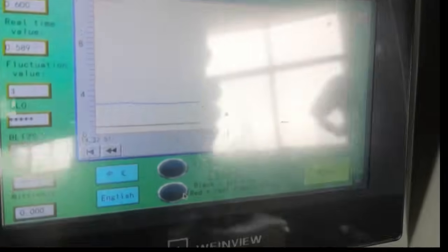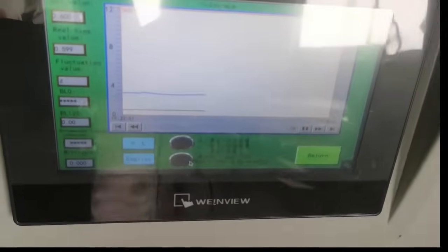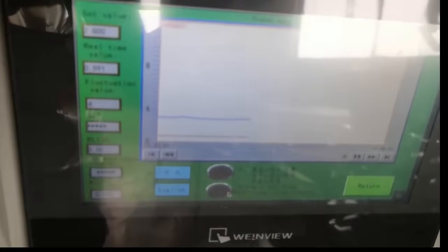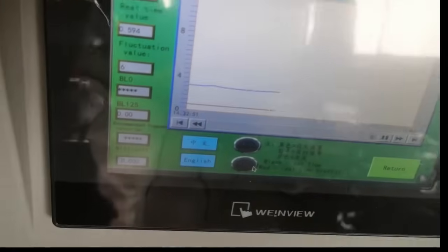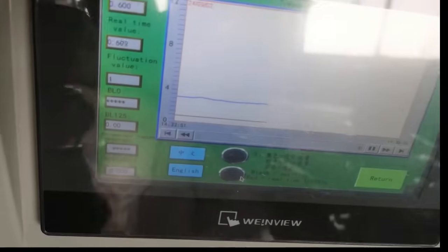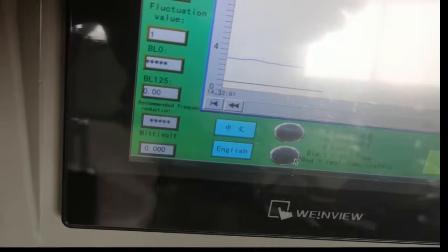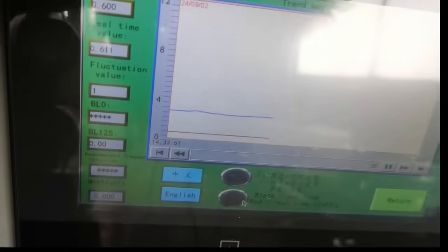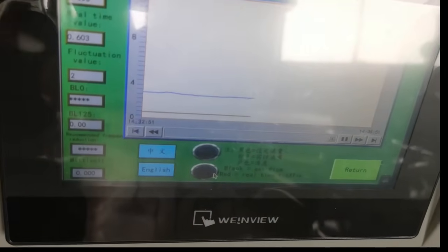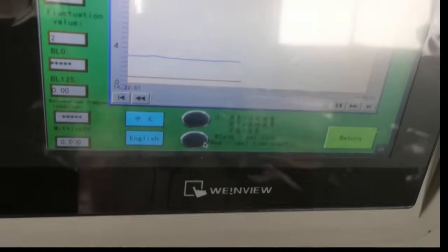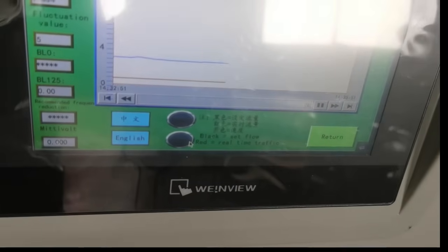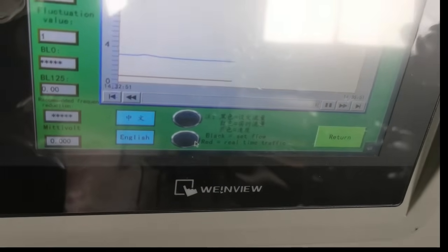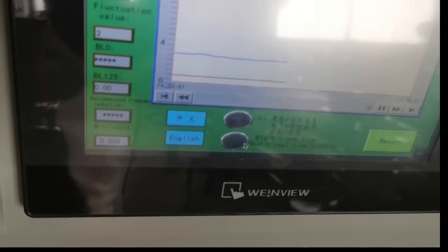There are three lines actually. Blue line means the running speed. And black, red line—black means set flow, and red is real time flow.